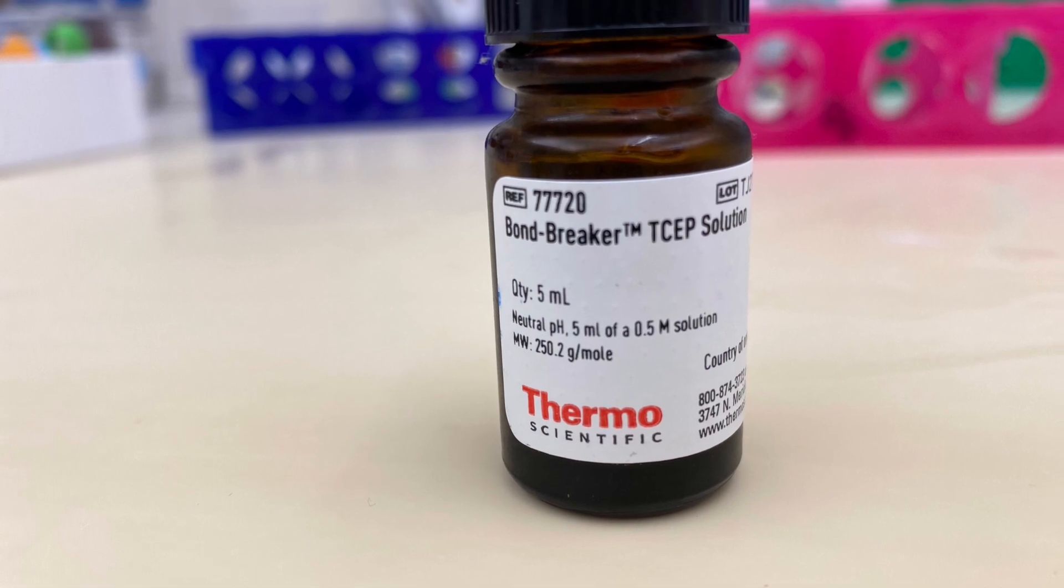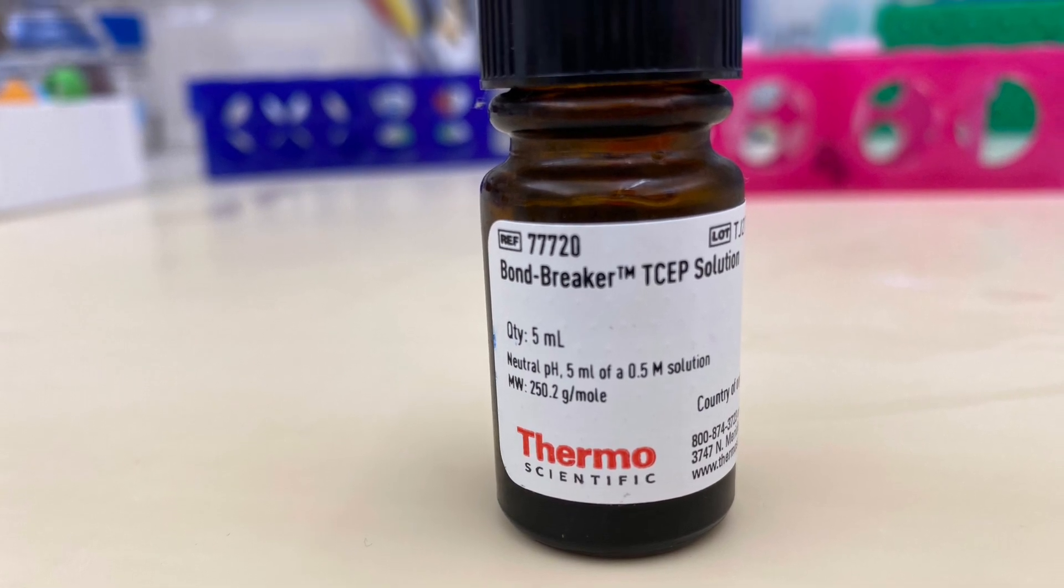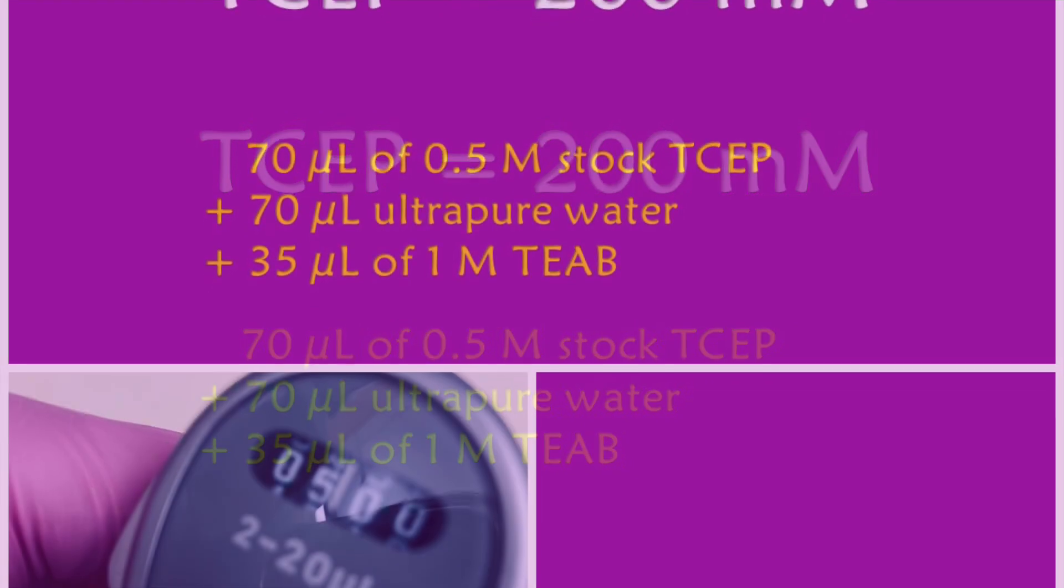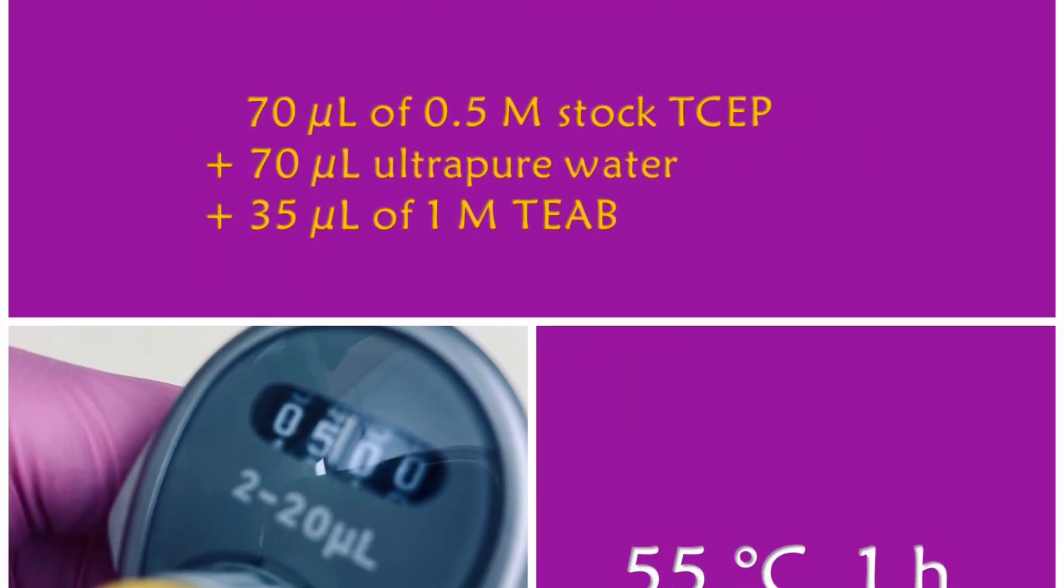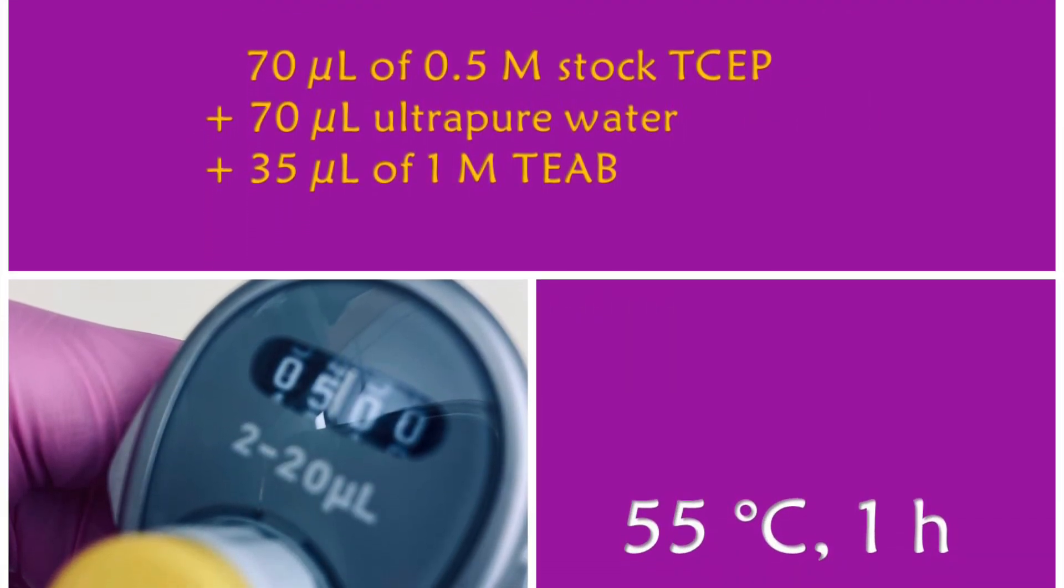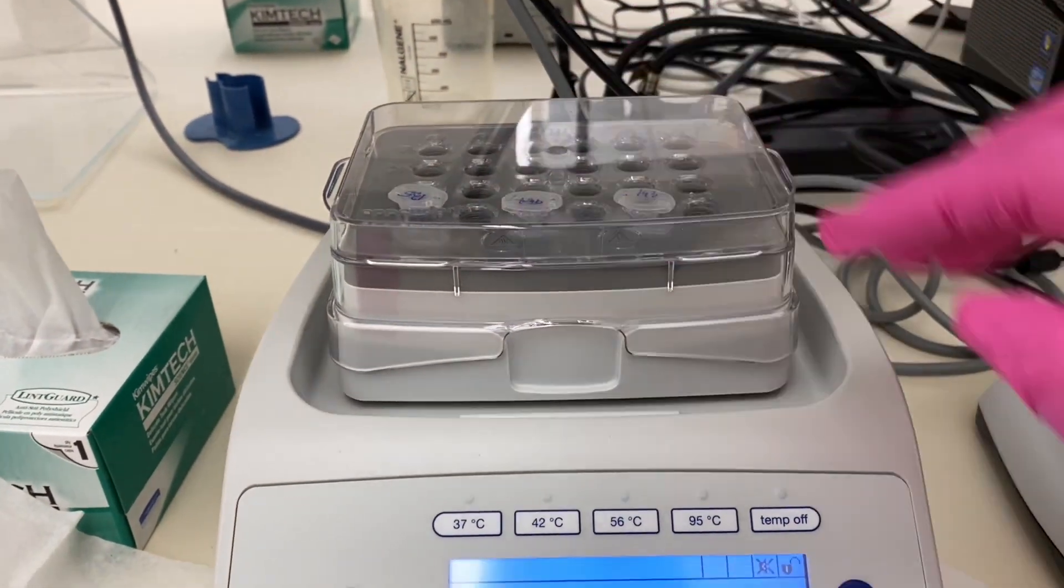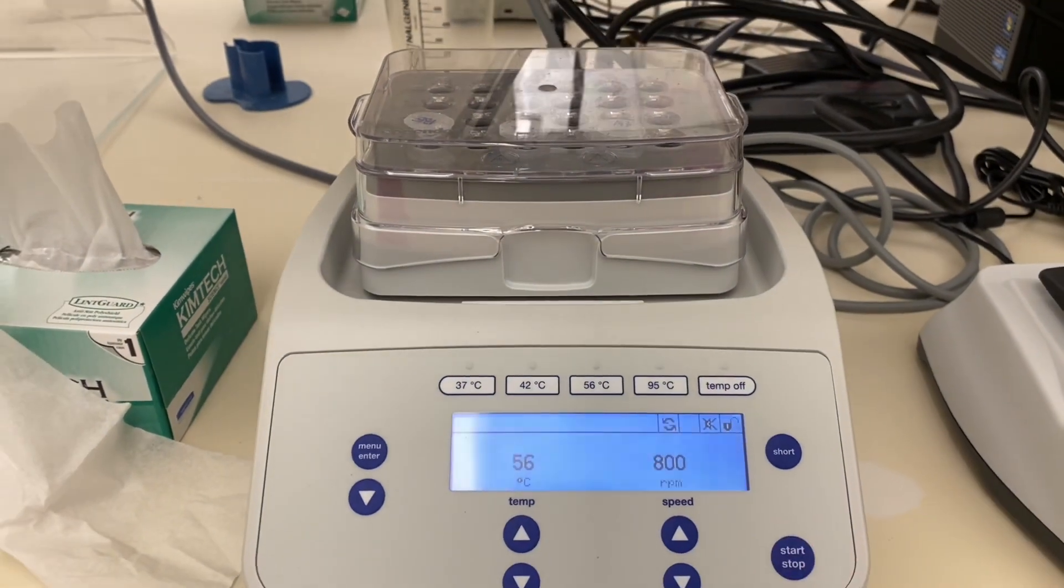For the reduction, I'm using TCEP solution. I'm going to need a 200 millimolar solution, so I have to make it from my stock. This is how I'm going to do this. After that, I will be adding 5 microliters of my TCEP to my samples, and I'm going to shake for one hour at 55 or 56 degrees Celsius on a thermomixer.